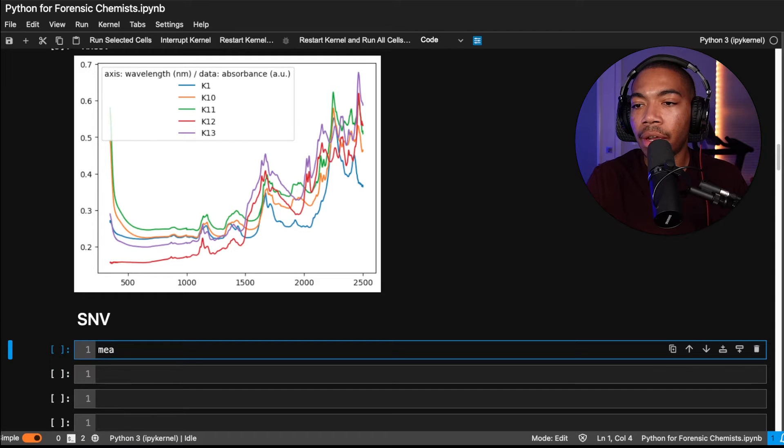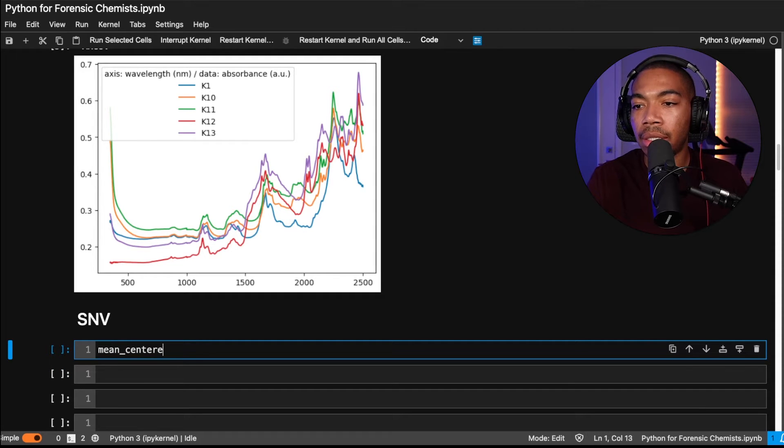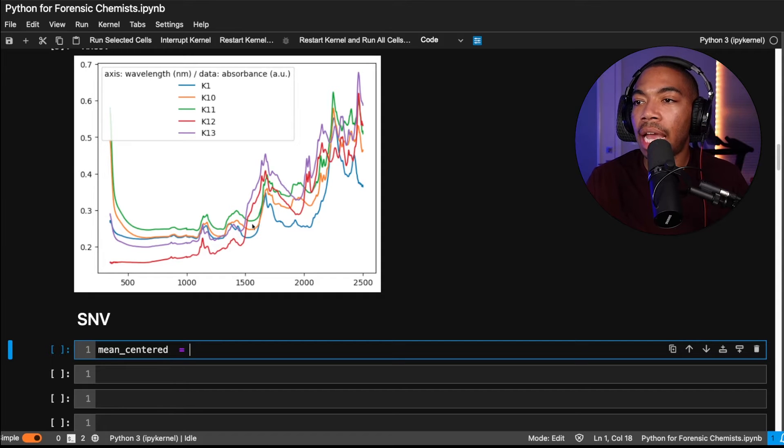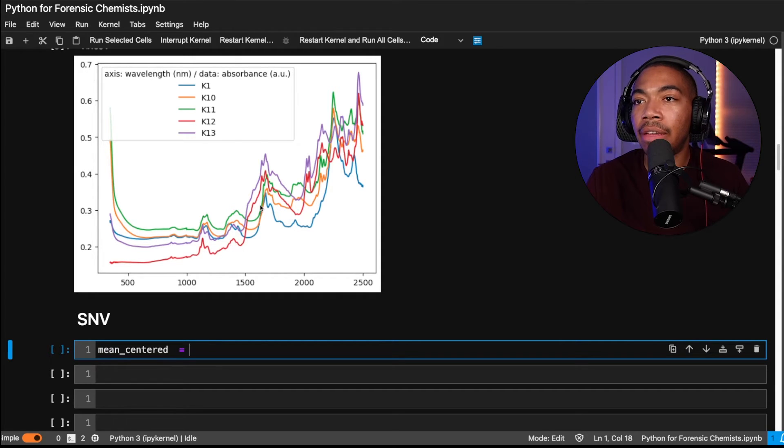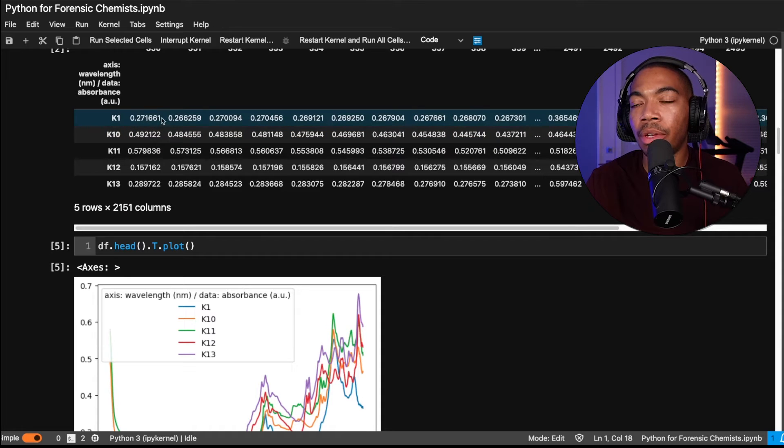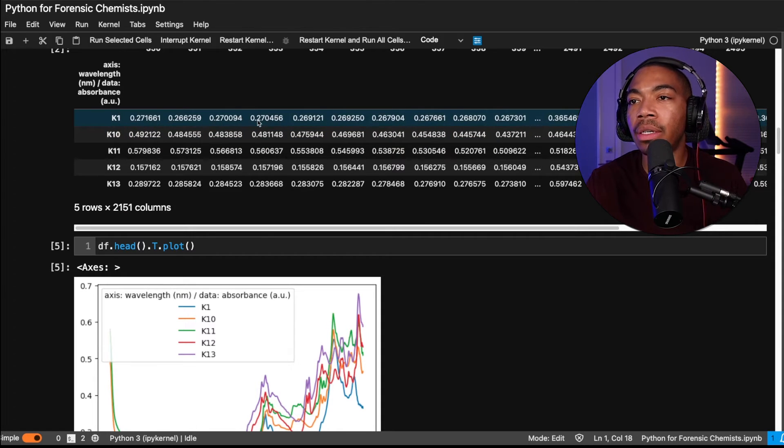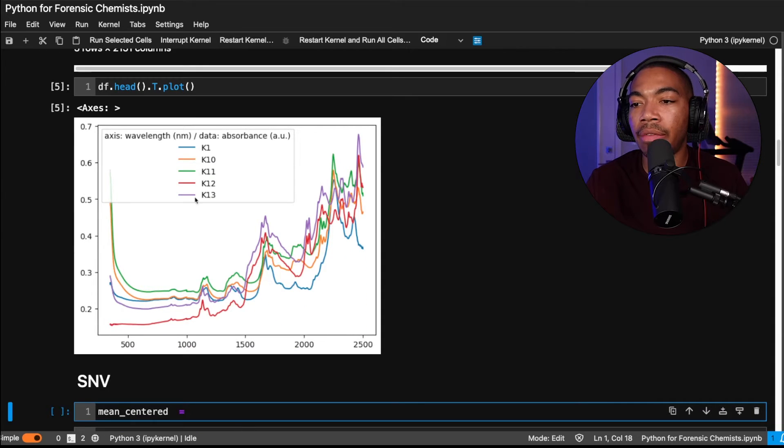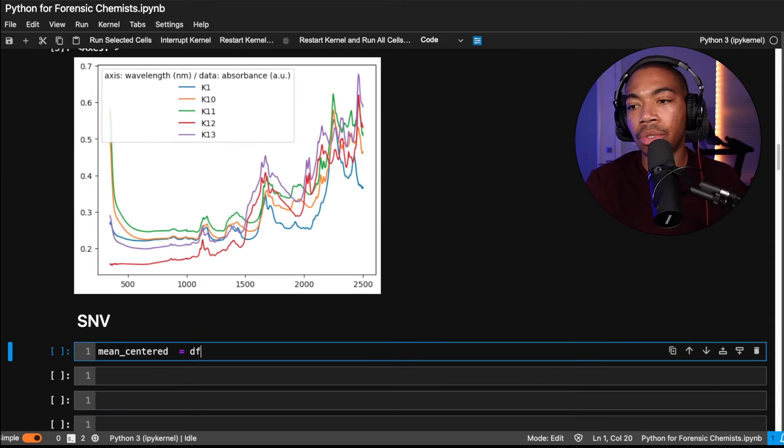So let's make a variable that's called mean centered. So what we want to do is subtract each data point from the average of all the data points in that individual spectrum. And so for k1, we will compute the mean value for k1, and then subtract each data point from that mean value.